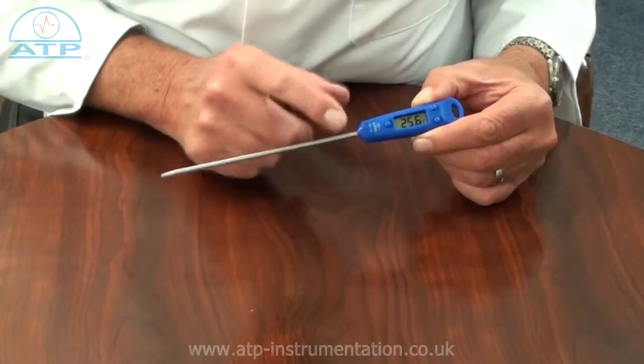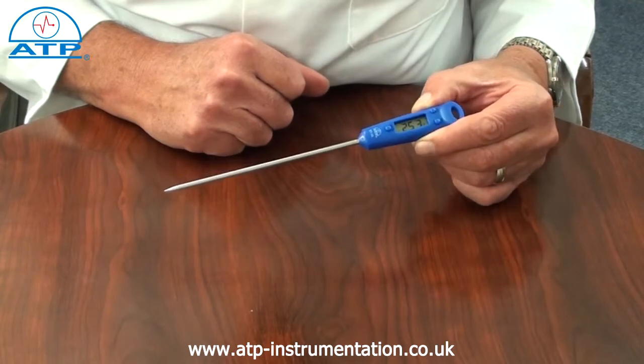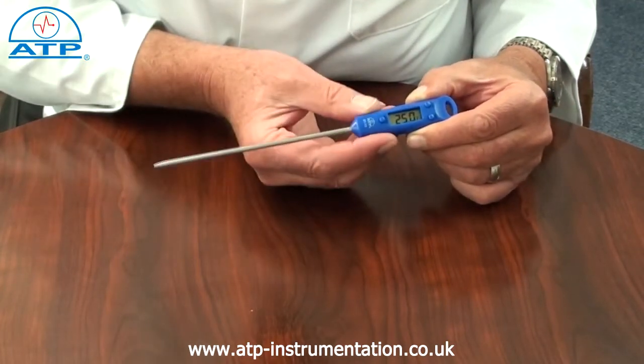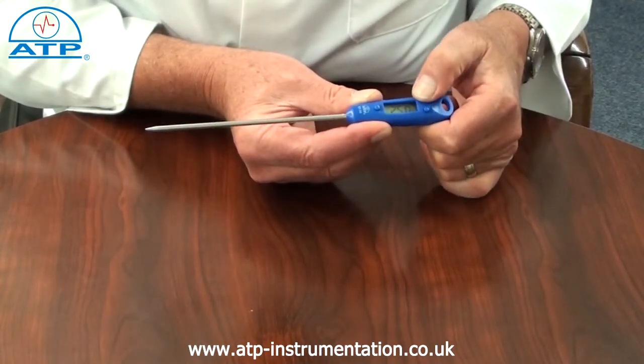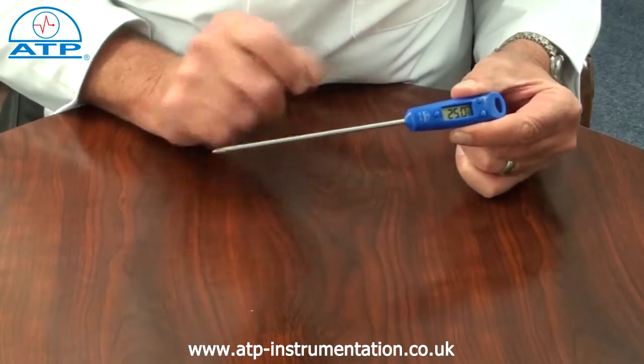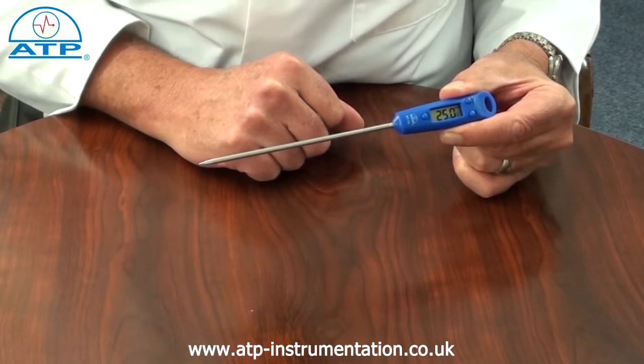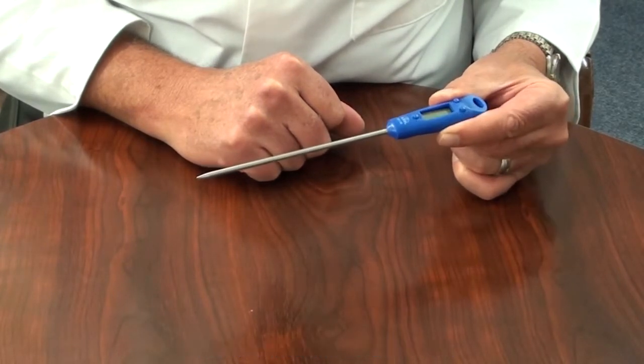The display is a 10mm high contrast LCD with clear digits and function indicators. The thermometer features data hold, which when pressed will hold the displayed measured value even if the probe is removed from the sample. There is an auto power off function after one hour of no activity.